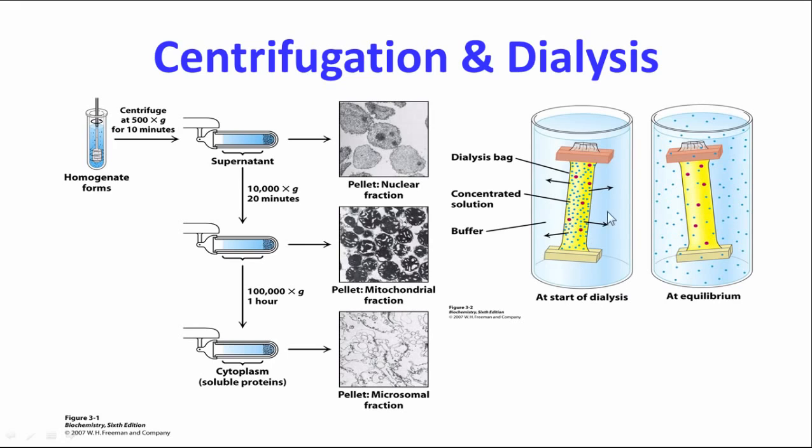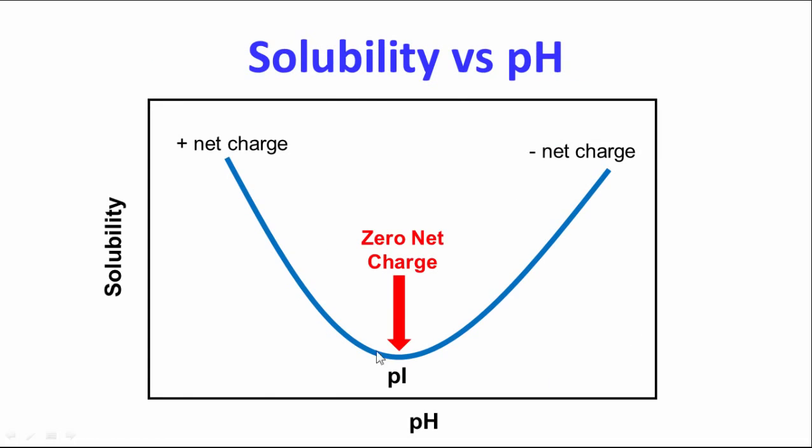You can also dialyze your protein. That is, when it has salt in it, you can put it into a buffer with no salt or water, and eventually whatever the ions are that are small will come out. Your protein, which is larger, will be held in. These bags can be of various molecular size exclusion. Usually it's about 12,000 is standard dialysis tubing, but you can also have various units that use semi-permeable membranes like this under nitrogen pressure, argon pressure to concentrate and dialyze proteins.